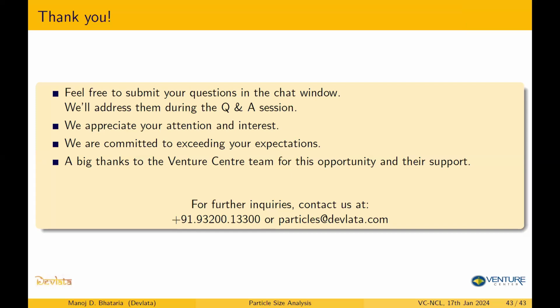So, sir, as an extension of this question, I just want to ask a small question. Yeah, go ahead. So, let's say some instrument has a 1 nanometer to 10 micron size range. If our sample falls at more than 10 micrometer, or if it is smaller than 1 nanometer, it is also out of the range.